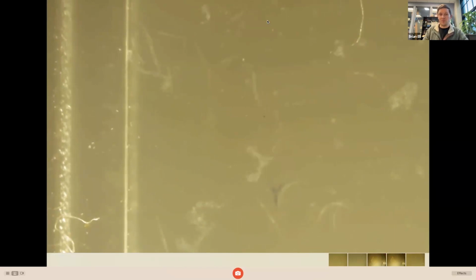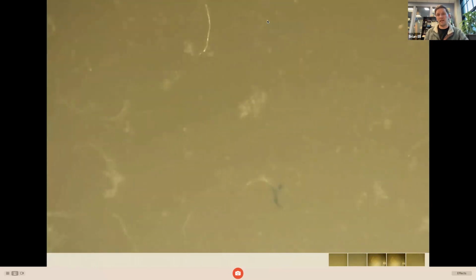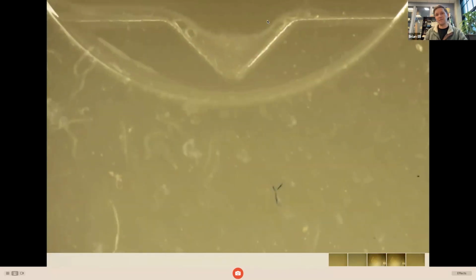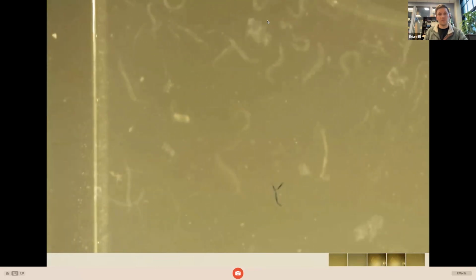As Steph mentioned, she put 10 microliters in there. It's a very small volume, so you can imagine that if it's sitting on a hot surface, it's going to heat up pretty rapidly. What I would do in that case is put your worms on it, monitor them for the 30 seconds, and then in the 2 minutes in between, just turn the light off. When it's time for the next thrash count, turn the light back on, do your 30 seconds, and turn the light off again. That will help prevent heat building up too much and prematurely killing them.